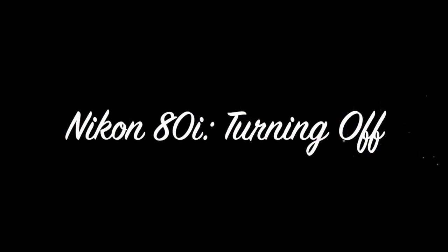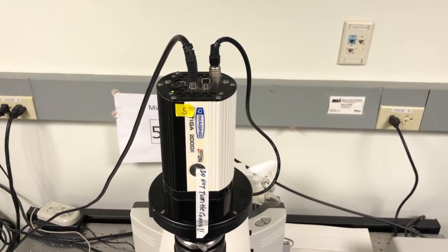In order to turn off the Nikon 80i, follow the turn on steps in reverse order.